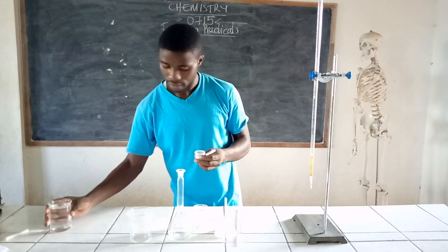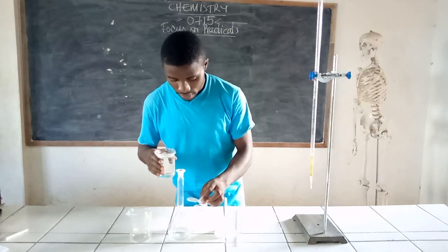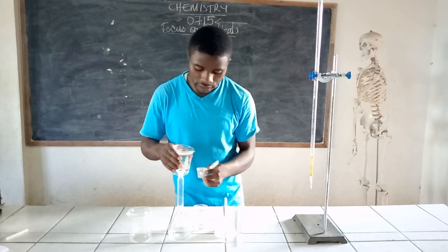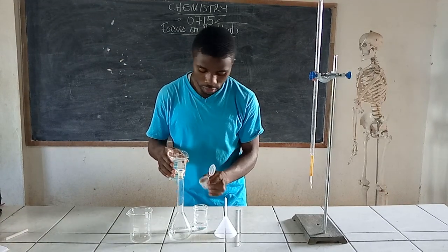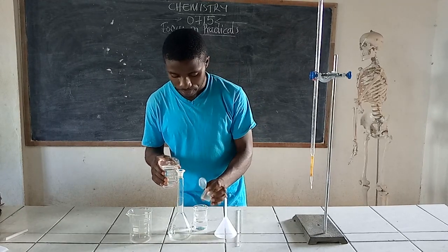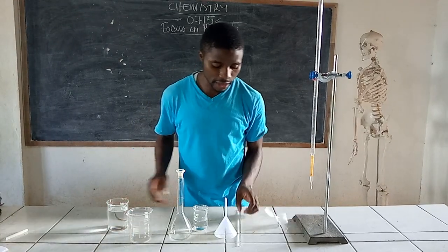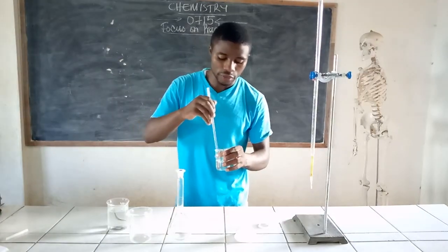Rinse the weighing bottle several times to make sure that all the particles or grains of your salt have been removed from the weighing bottle. Do that several times. When it is done, set it aside and get your stirrer, which has also been cleaned, and try to dissolve the salt.